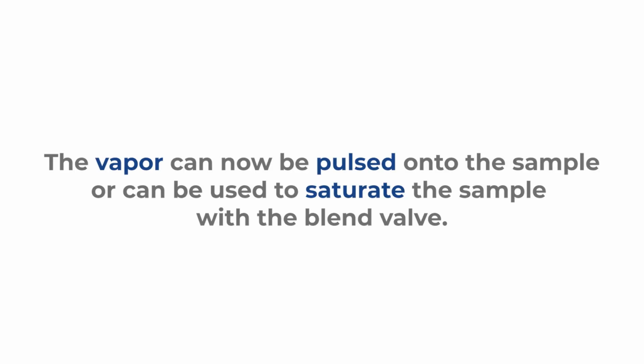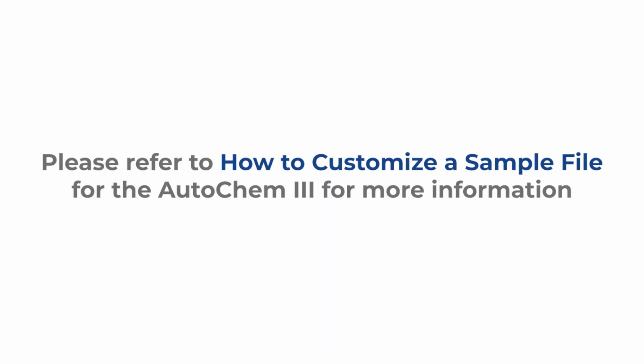At this point, the vapor can be pulsed onto the sample or can be used to saturate the sample with the blend valve. To see how to create a sample file, please view our How to Customize a Sample File video.